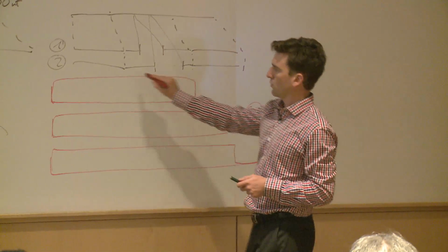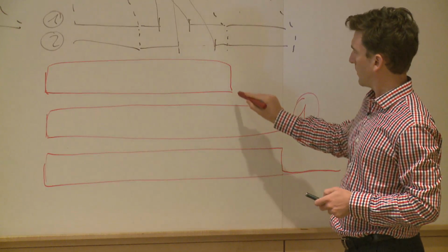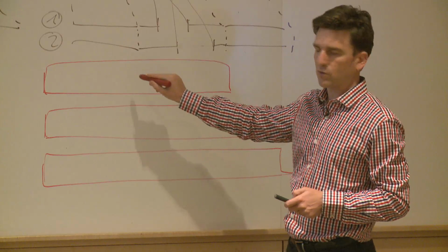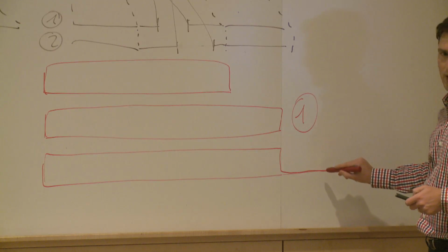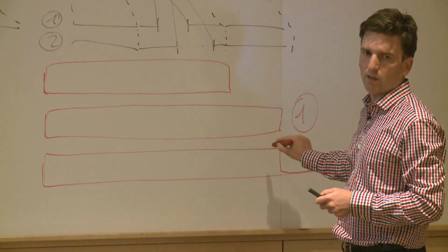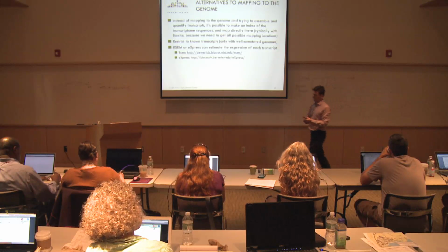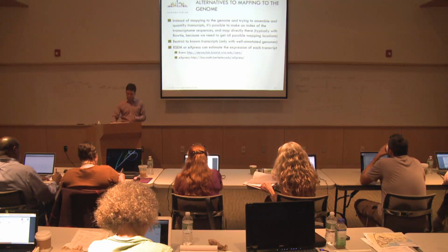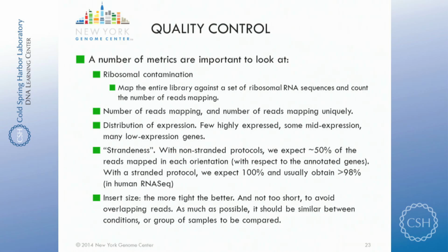Here you have a uniform coverage, as well as here, but all the reads that contribute to this coverage here are also present in that isoform, as well as they are present here, but here you see that you don't have coverage on the extremity. So that's what RSEM or Express is trying to do: to find out, from these coverage plots, what is the most likely transcript for these alignments. So that was just the alternative strategy.